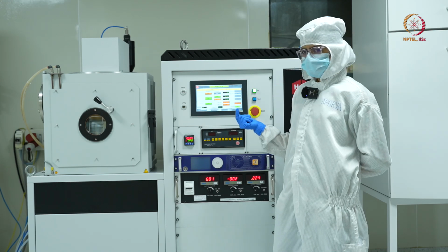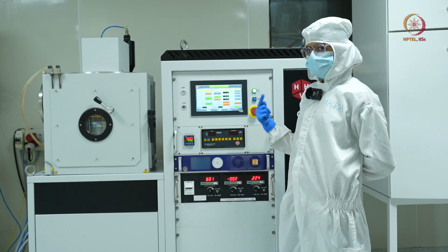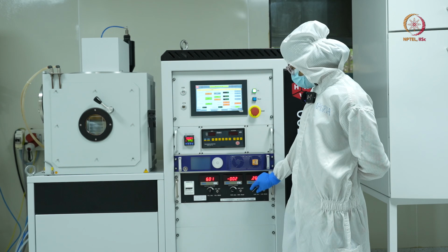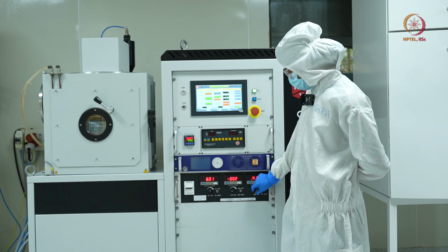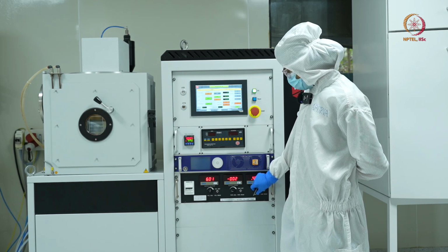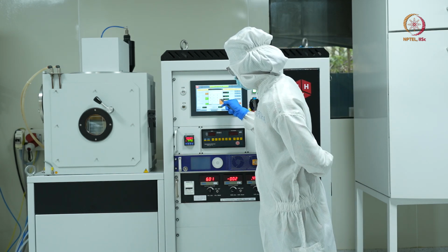But it might happen that the argon atoms inside the chamber are not sufficient and the plasma does not strike. So once I go to 0.5 amperes, I'll increase the gas flow as well. Now it's 0.45 and I'll increase my argon gas flow to 12.